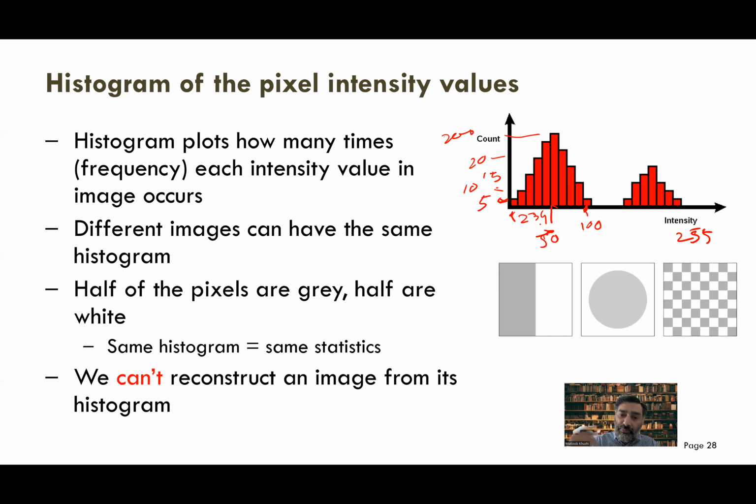So we expect to see a number of regions, and usually there's this kind of gap. So that's where our threshold is. In these images, our region of interest is this gray area.